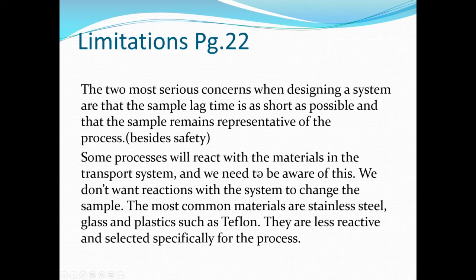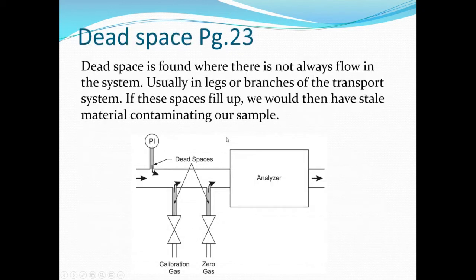And we don't need to be ninja gurus for this. Like I say, there is a table. So all you have to do is understand your process and then apply one of these sorts of tables so that you're picking a compatible transport material.